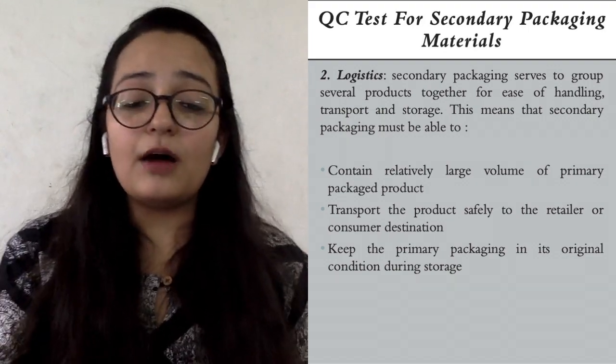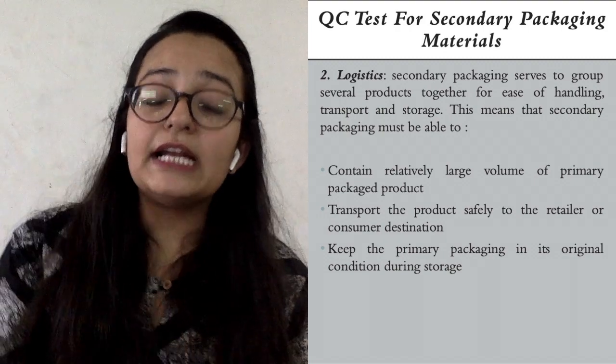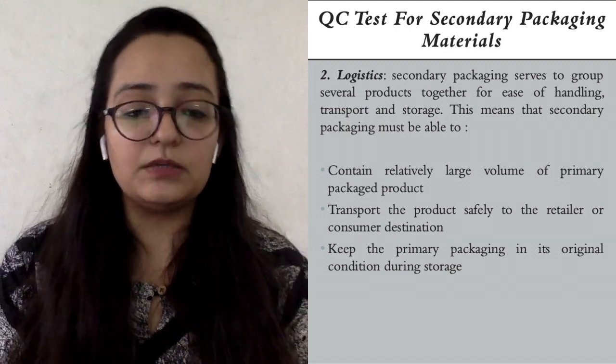So it's all about the quality control test for container, closure, and secondary packaging materials.